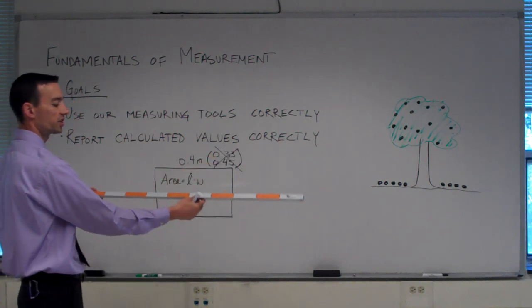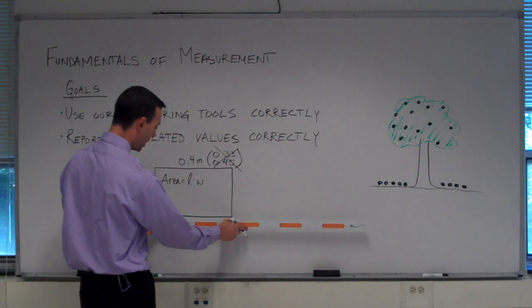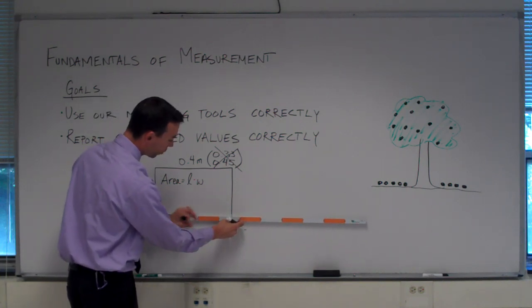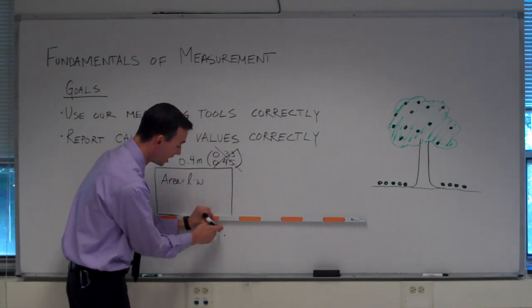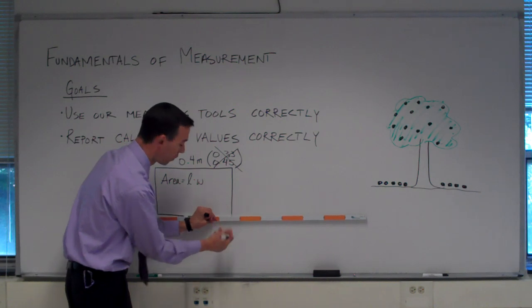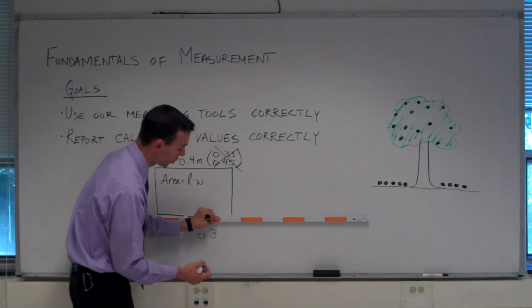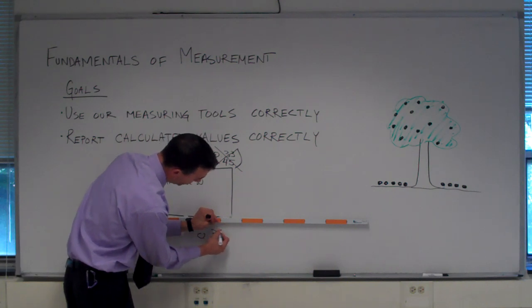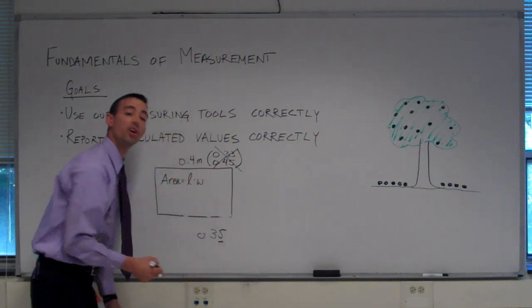If I turn to side B and go back and measure my rectangle on the bottom now, I can now see, oh, it was not quite 0.4. Here's my, it's hard to see, I appreciate on the video. Here's my 0.3, here's my 0.4. So I now know that it's 0.3 for sure, and I'm going to mentally divide the area between 3 and 4 into tenths and say, okay, I think it's about 5. This last place is our guess.